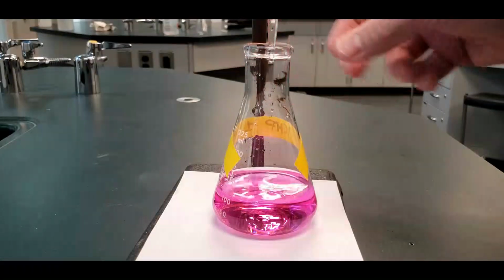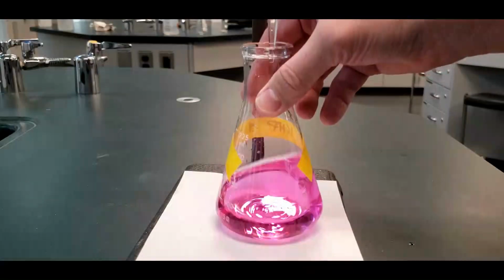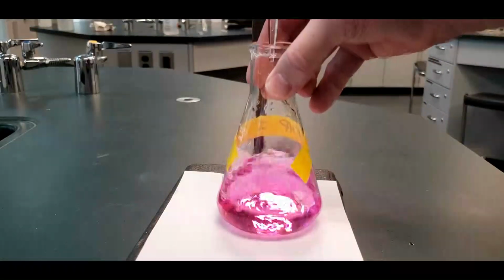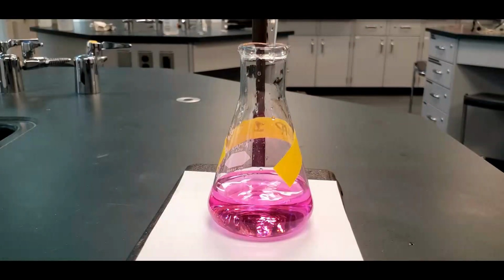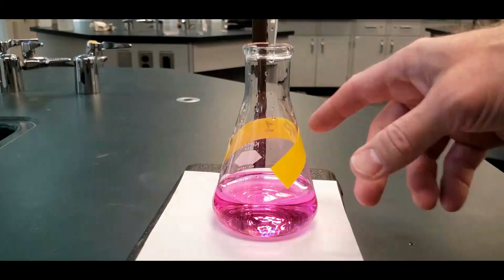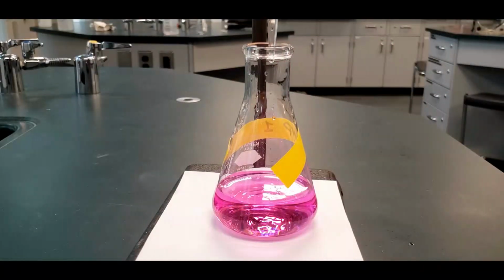We go, I overshot it just slightly. Opening and closing it like I did there, that's probably less than 1/4 of a mil. So even though it does look a lot brighter than the one that I did earlier, it's probably not too bad. But now that I know where it is, it looks like about 18.7, something like that. Now I know exactly where I should be going for the other two titrations I'm going to do, so I shouldn't overshoot those.